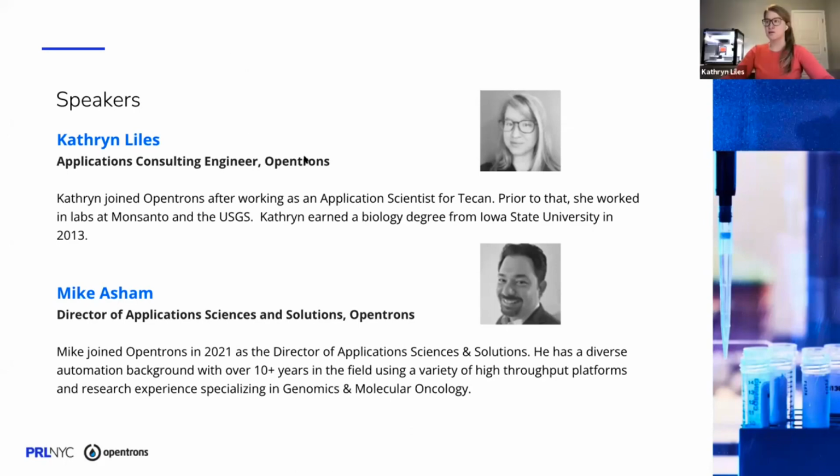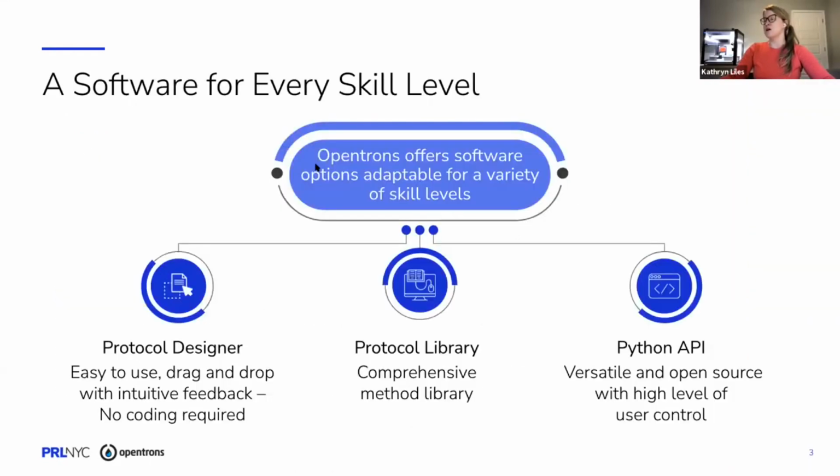All right. Good morning, everybody. Thank you for joining us for the webinar today. So today we'll talk about the Opentrons Protocol Designer as a way to generate protocols for the OT-2 without any sort of coding needed. So just a quick overview.